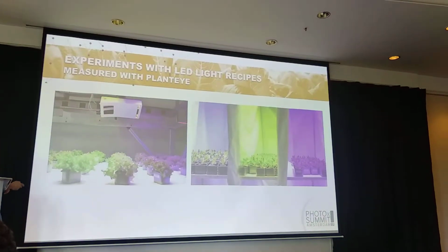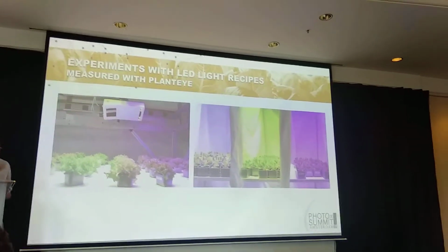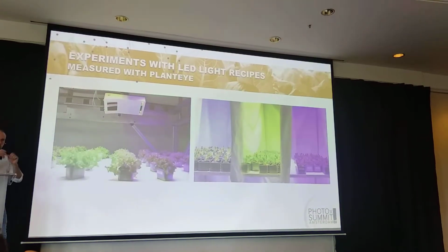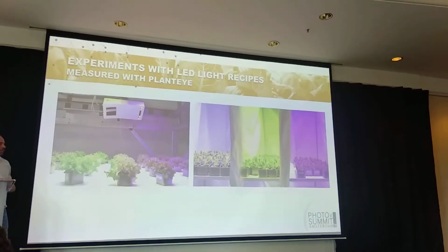So unfortunately you cannot see them, but up there are the Phytofy lamps. And I guess you are all familiar with the Phytofy lamps. It's these 5 wavelengths, so it's quite nice. You can exactly structure the light composition without actually changing the intensity.